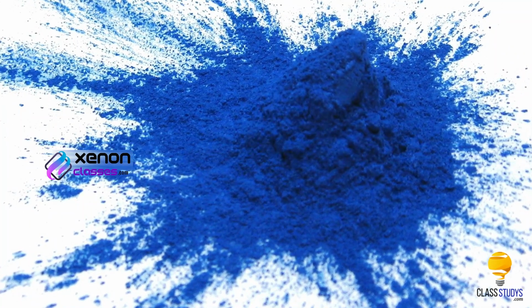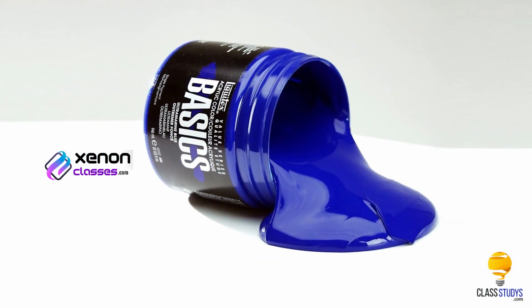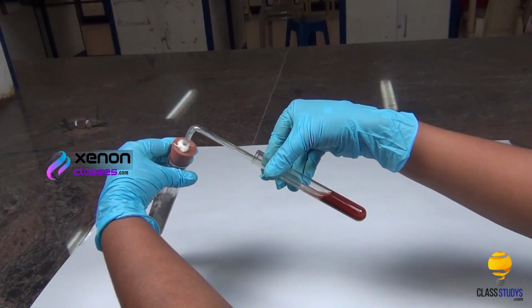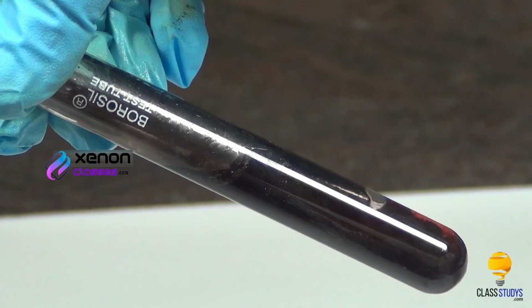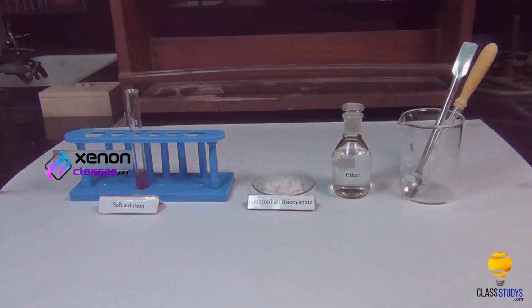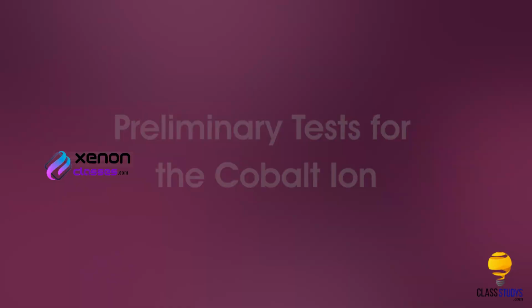Cobalt-based blue pigments like cobalt blue have been used for jewelry and paints and to impart a distinctive blue tint to glass. In group 4, cobalt ions are precipitated as their sulfides by passing hydrogen sulfide gas through their solutions. Our aim here is to test for the presence of cobalt ion in a given salt. First, we look at the preliminary tests for cobalt ion.